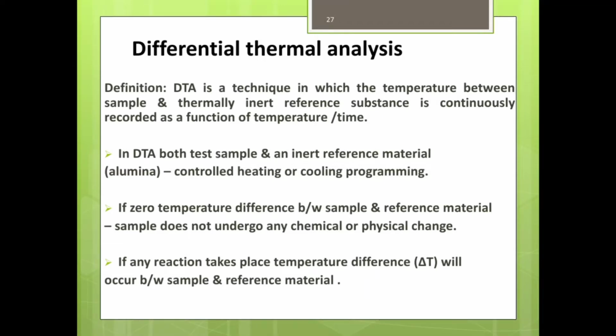Today we are going to learn differential thermal analysis. Differential thermal analysis is a technique in which the temperature difference between the sample and the reference material is continuously recorded as a function of time or temperature.